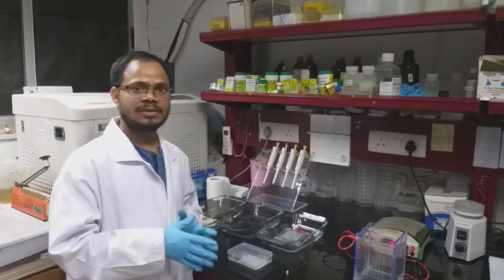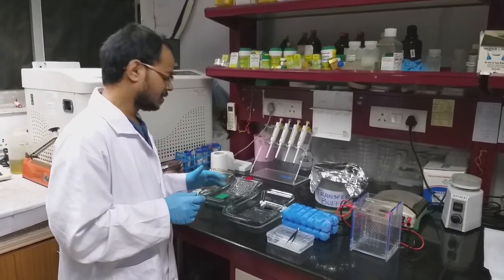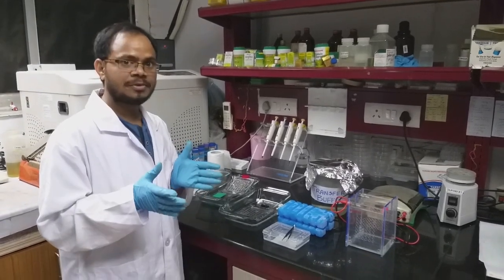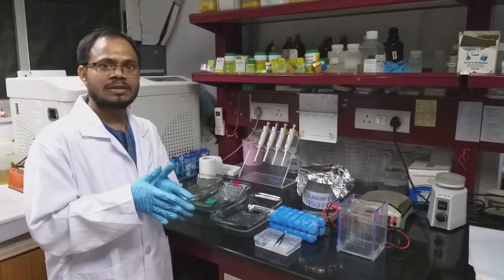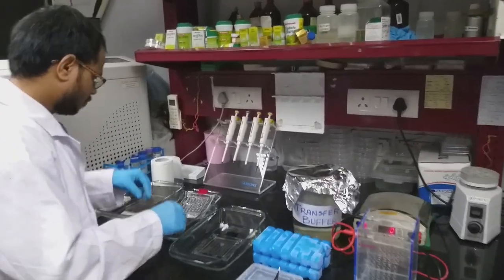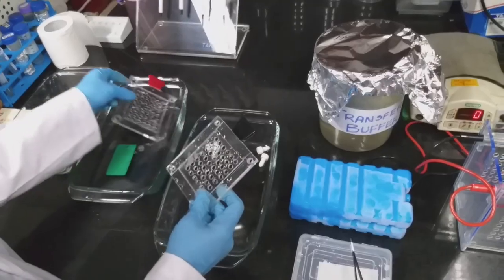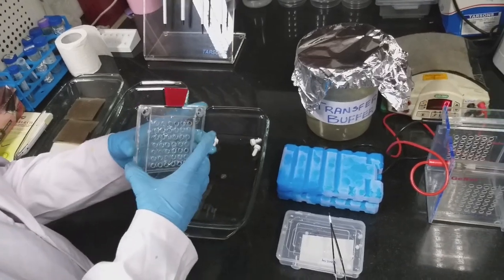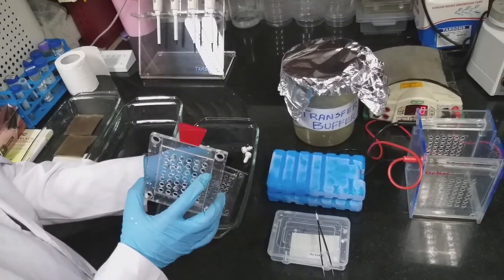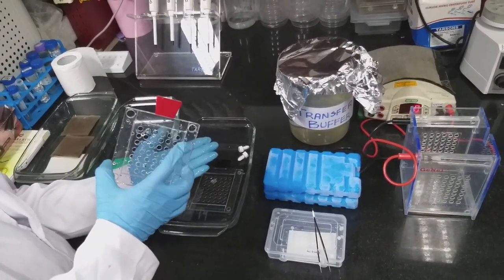And let's start the procedure. We need a pre-run gel. We already finished the gel running. In addition to that, we also need sponges, which will give cushion to the gel, so that the gel may not be destroyed during the transfer. This is the cassette we'll use for the transfer. This is the negative side of the cassette and this is the positive side. We are going to keep the gel on the negative side and the blot membrane on the positive side.